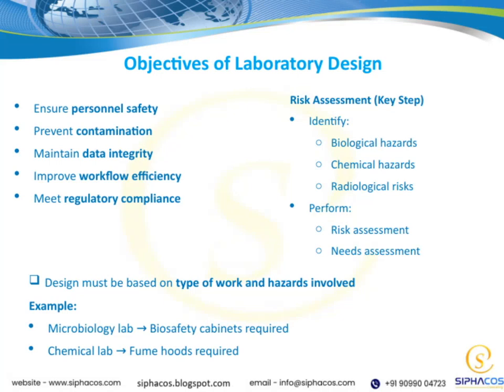When designing a laboratory, it's crucial to tailor the setup based on the type of work being done and the hazards involved. For example, in a microbiology lab, biosafety cabinets are essential to protect personnel from airborne pathogens. Conversely, in a chemical lab, fume hoods are necessary to vent hazardous fumes safely. A key step in this process is conducting a thorough risk assessment.